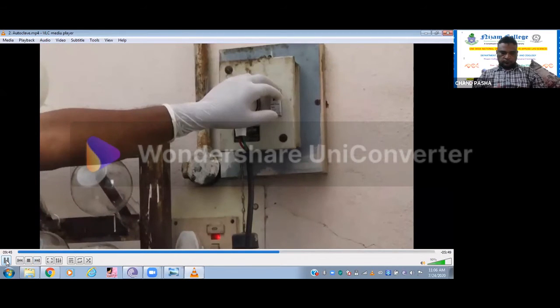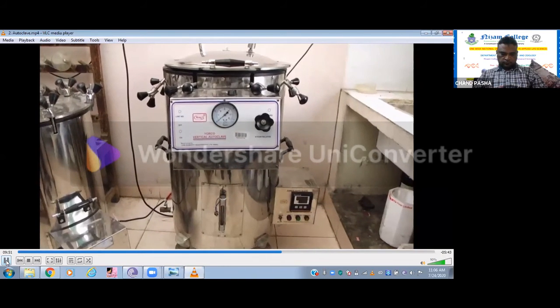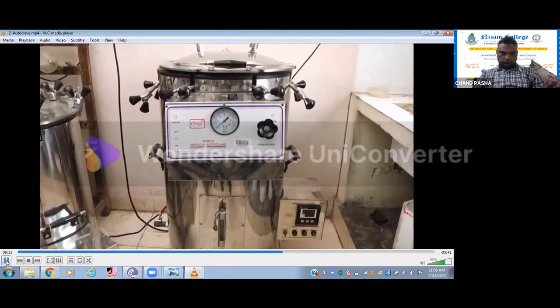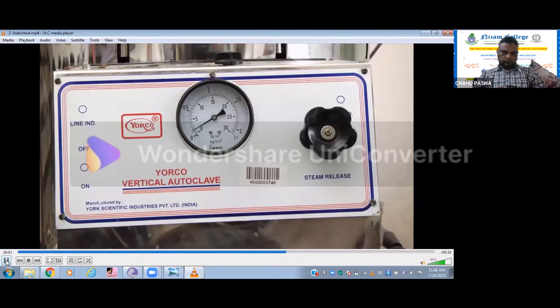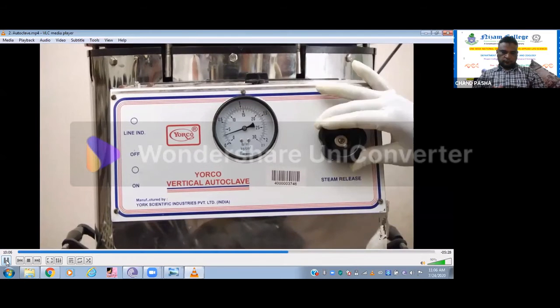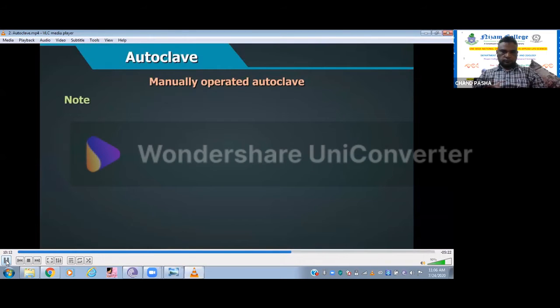At the end of sterilizing time, turn off the heat and allow the autoclave to cool naturally. This will usually take several hours, particularly for agar culture media, to cool sufficiently for safe handling. When the thermometer reads below 80 degrees centigrade and the pressure gauge registers 0, slowly open the draw-off cock to vent the autoclave. Open the air cock and wait for a few minutes before opening the lid.